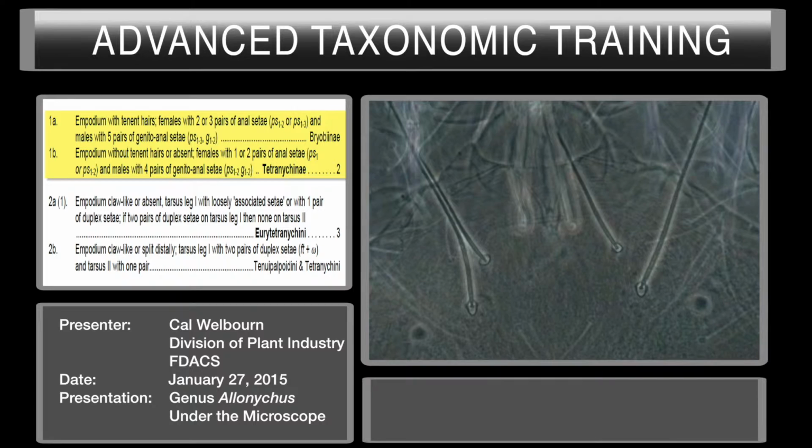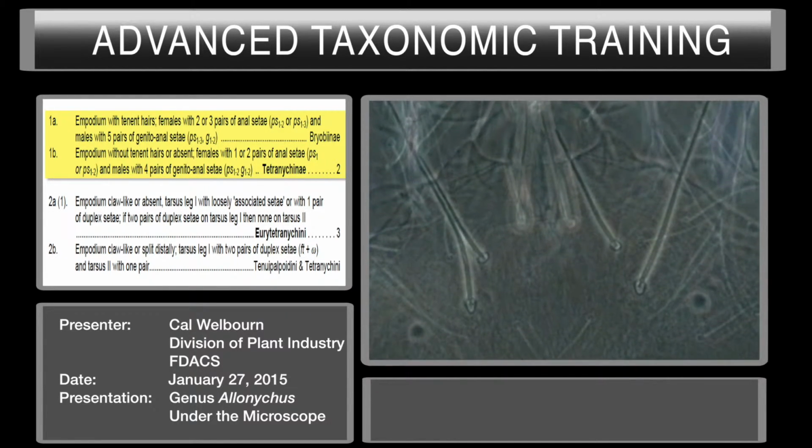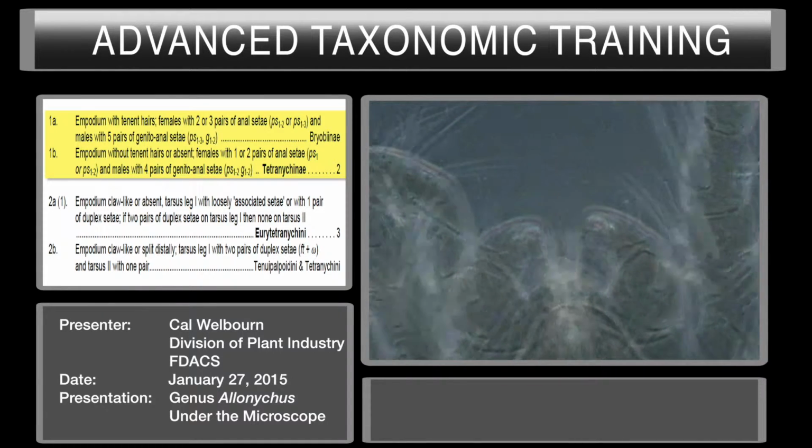In couplet 1, we're separating the 2 subfamilies of Tetranychidae. And the first couplet is empodium usually present and without tenent hairs. Empodium may also be absent. Females with 1 or 2 pairs of anal setae, males with 4 pairs of genital anal setae, versus empodium always with tenent hairs, females with 2 or 3 pairs of anal setae, and males with 5 pairs of genital anal setae. So we're going to look at the empodium, and usually you have to look at several legs to see a good view of the empodium.